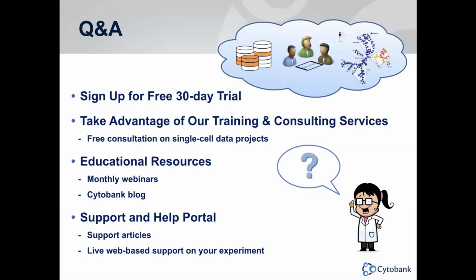So some of those steps are basically outlined with all our procedures with general generation of flow cytometry data, and they include the quality assessment of the instrument. So we usually review that all before we do any analysis of the data. We also look for batch artifacts using some analysis templates that we mostly do in FlowJo. There are also several scripts that would automatically scan for irregularities in your cytometry data. So we use several R packages for that, and also some FlowJo plugins.